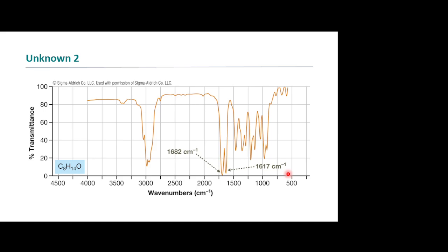So when you're looking first at something you don't know, you always look upstream. Okay? Because if you look downstream, see how complicated that is? That's hard to read, isn't it? So you always want to go 1440, 1400-ish and above. Specifically, I would actually start in this region right here. Okay? All right, now, so what sort of groups do we have?